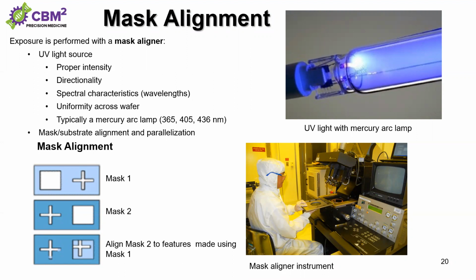They put the photomask on top of the substrate, and using the microscope, they look from top to bottom and try to align the two different mask patterns together. With this method, you can have alignment better than around 1 micrometer. If you want to improve this alignment accuracy, these days people are using the interferometer method.